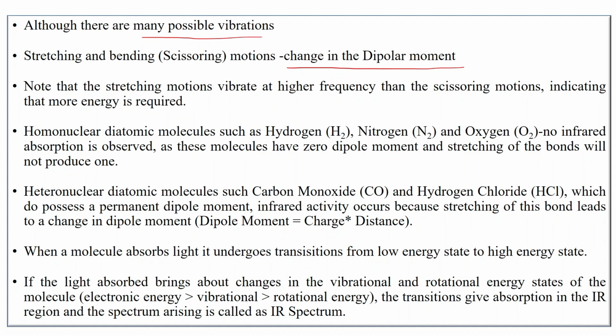That is, if any vibration has to cause a change in the dipole moment, then only it will absorb the IR radiation. So note that stretching motions vibrate at higher frequency than the scissoring vibrations, indicating that more energy is required.